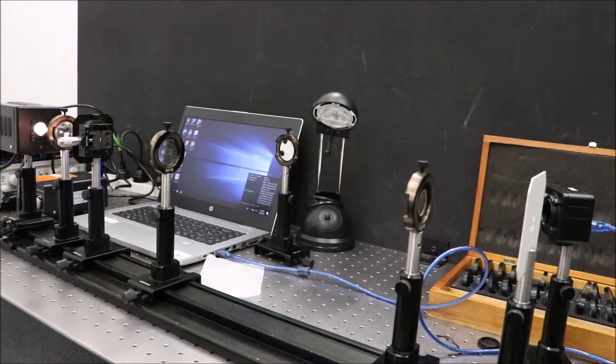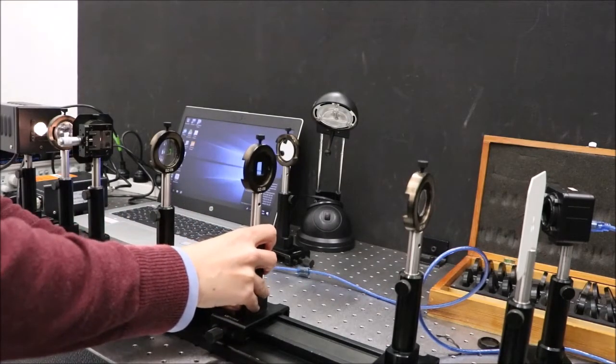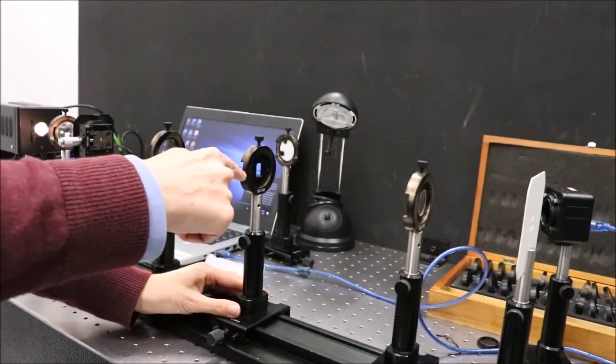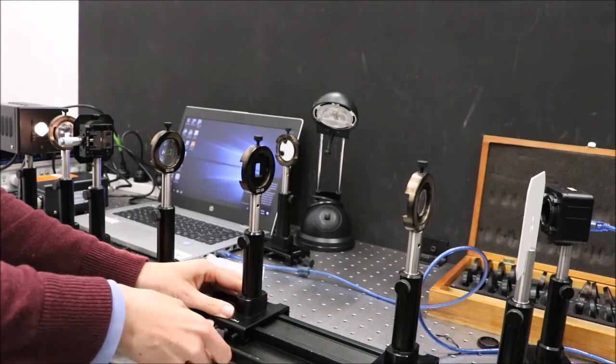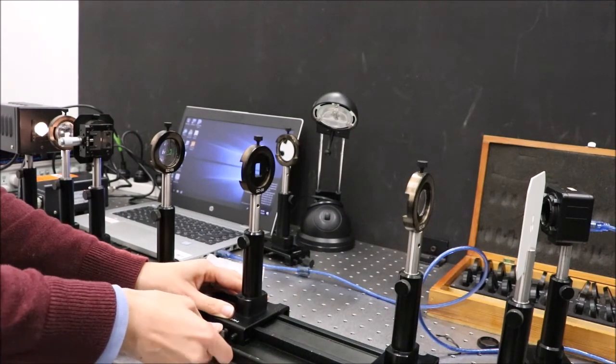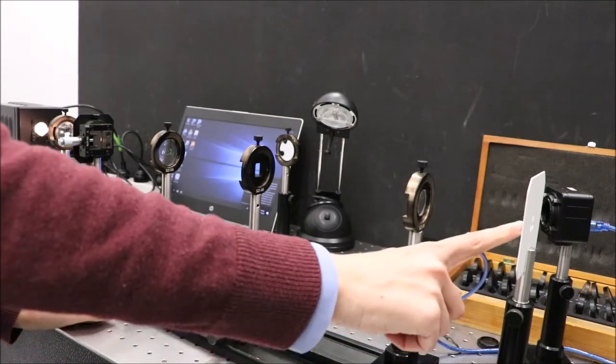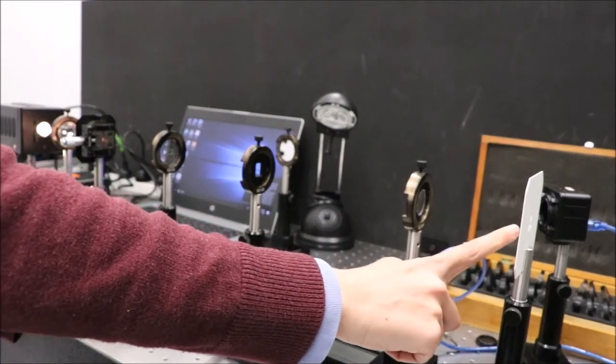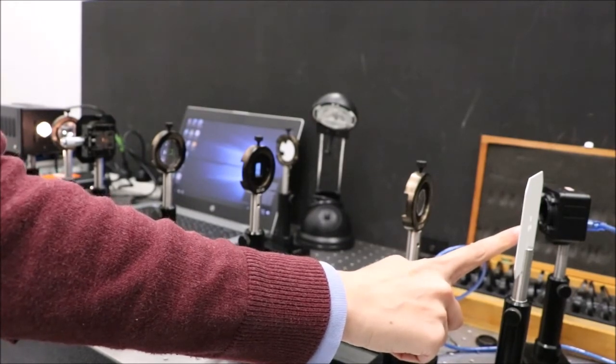Now we're going to add the transmission grating. It doesn't matter where it goes because the light along here is parallel. And as soon as we do that, what you can see on the screen is no longer one image of the slit but the image of the slit that's been split into all of its colors.